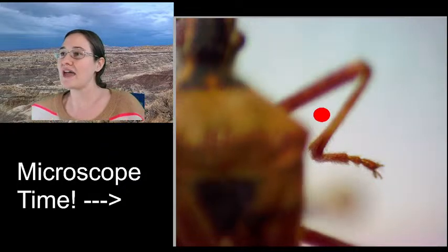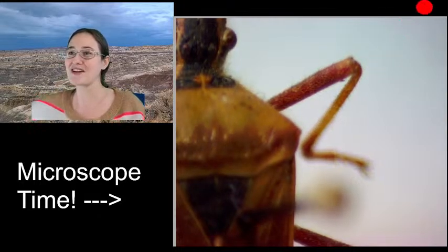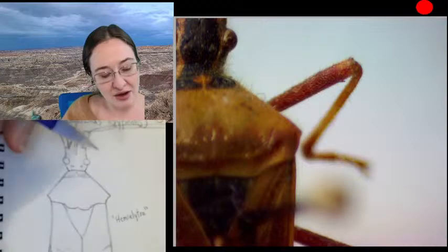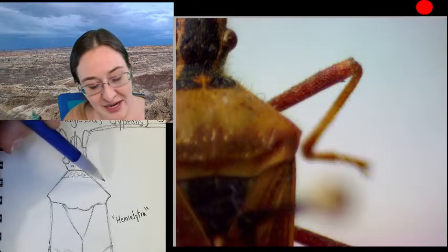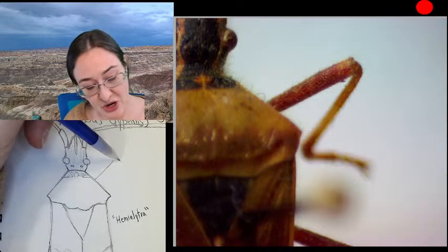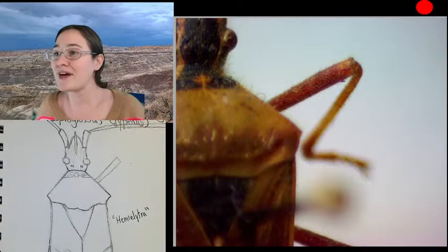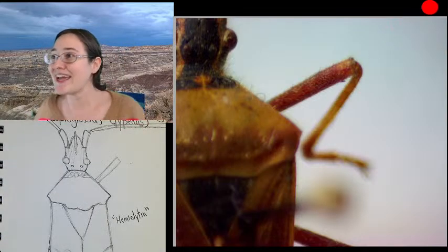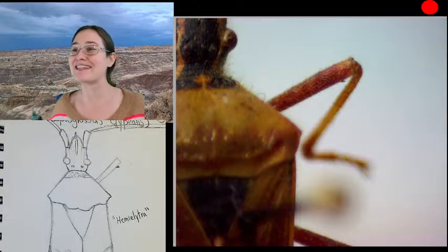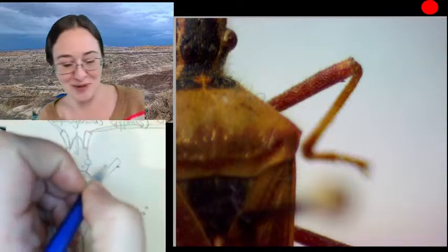All right. As I teach insect legs, I like to think insect legs aren't that much different from human legs. If you think about the bone structure, right? In our legs, from our hip to our knee, that big bone in there is called the femur. So we've got a femur. And I could zoom in just a little bit, but I am here to tell you that right here, he's got a little femoral spine. And if you know me, I love my little spines. I love tibial spines. I love femoral spines. So, yeah, that's where we're going with that.